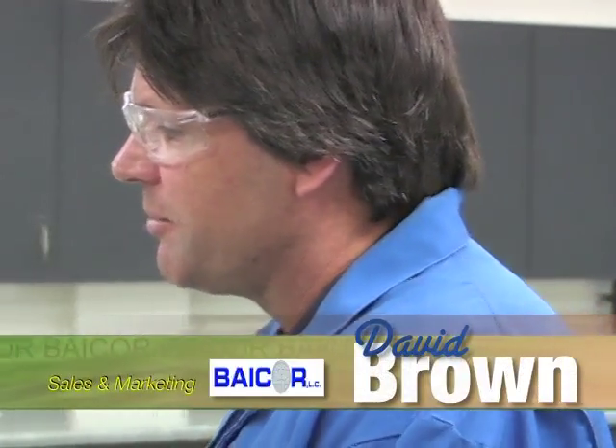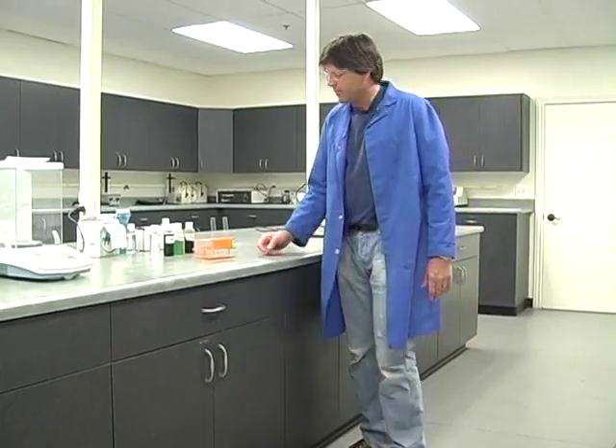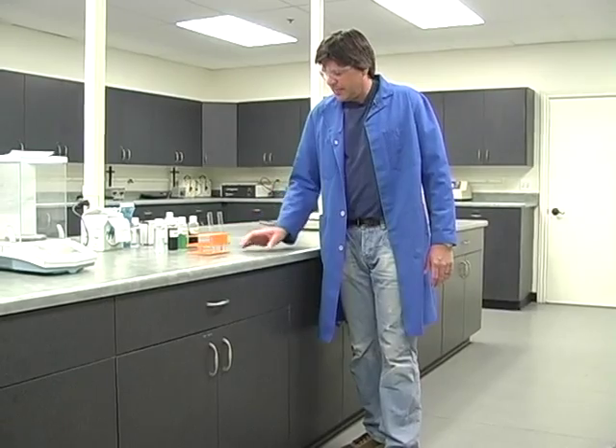We're just here in the lab at Bicor where they mix and test the nutrients. What I'm going to show you now is a compatibility test on what a chelate actually does to help protect the nutrient from falling out, so it's better utilized by the plant — improving uptake and translocation.